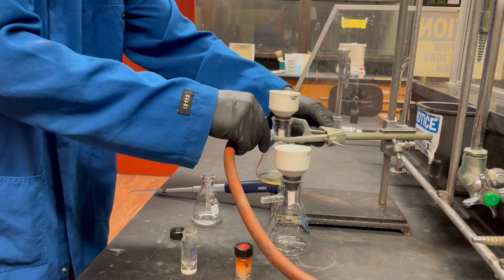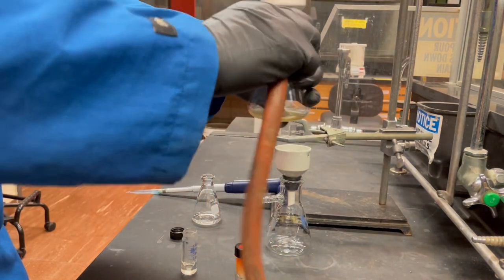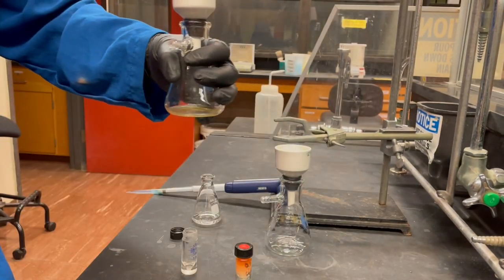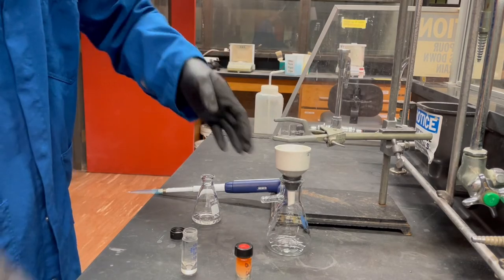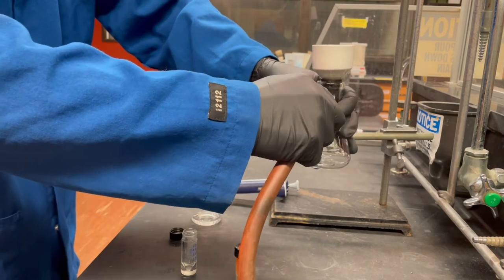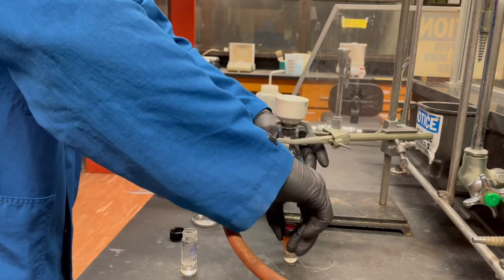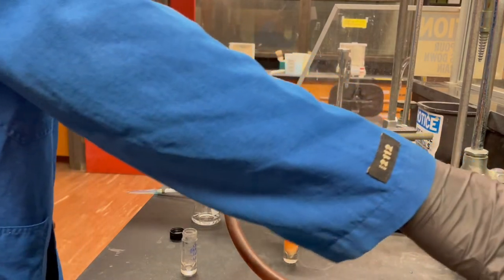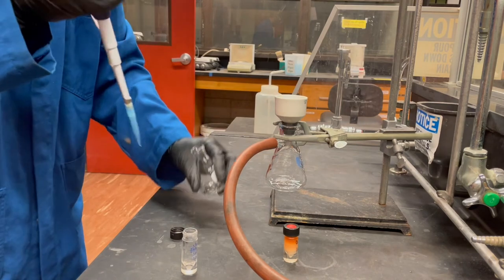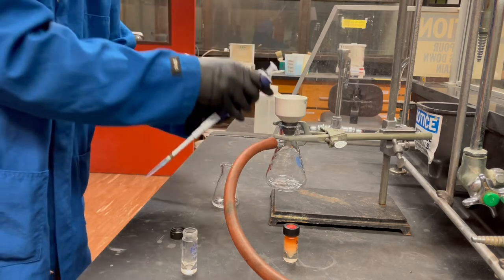I'm going to take this off though. This guy's going to just hang out in the drawer overnight. Turn that off. We have to get it out of the light as quickly as possible, so I'm going to do that right now. You're not going to see that, but just know that I'm placing it inside of a drawer. I'm going to put parafilm on that before I leave so it doesn't evaporate, because otherwise I'll have to add more solvent to it in the morning. I don't want to waste materials, and I don't want to introduce more variables.